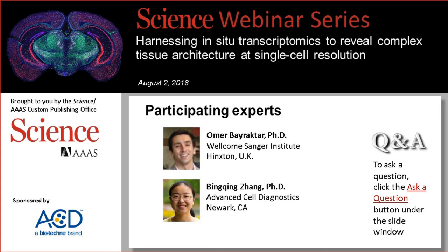Thank you very much, Dr. Zhang. So let me stay with you with a question that asks, what is the sensitivity of detection for this assay, and can cells with rare RNAs between 10 and 100 copies perhaps be detected?